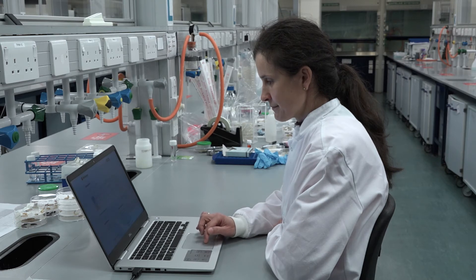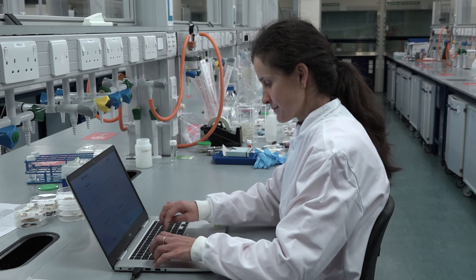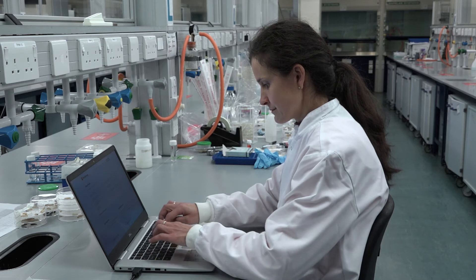True Larve Galleria Mellonella are a live product and we recommend using them within one week of receipt. Planning is therefore essential. Please place your order with Biosystems Technology the week before you require larvae for your experiments.